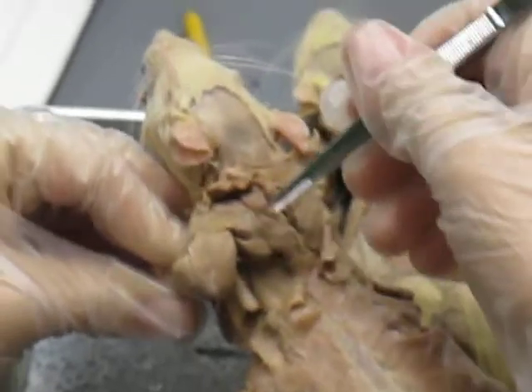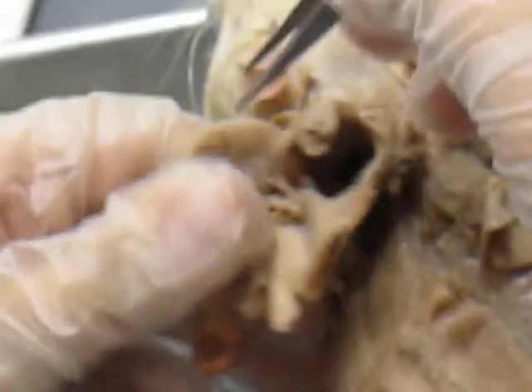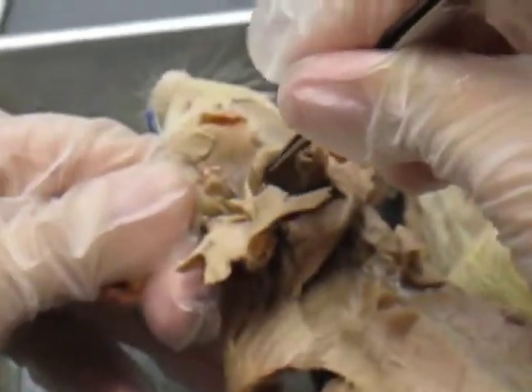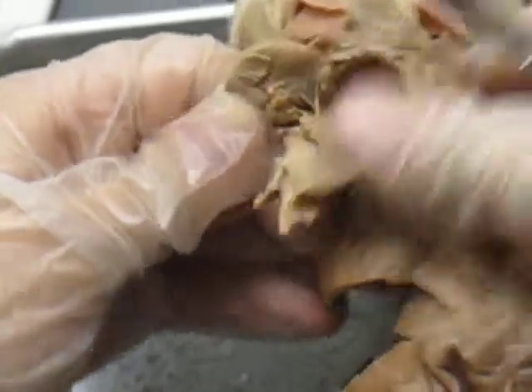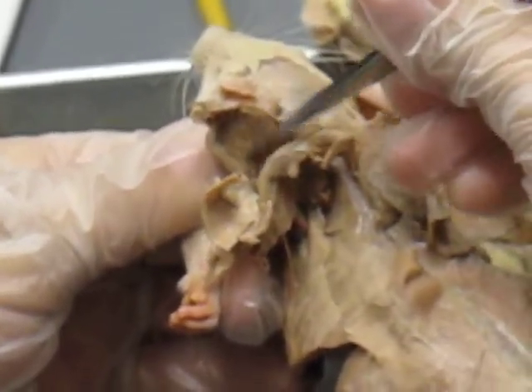You had your supraspinatus, which was on the top and wrapped around to the back. And your terrace major, which is on the bottom, and also wraps around to the back. And on the back, on this side, is your subscapularis.